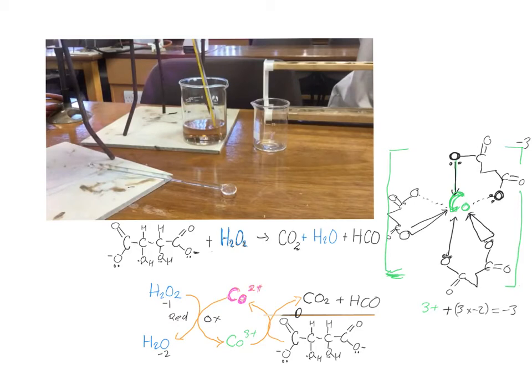And at this point here you can see the pink cobalt being converted into the green oxidized cobalt 3+ ions. You can also clearly see effervescence is happening as carbon dioxide starts to be produced as this species here starts to break down. Notice that the green colour persists for quite a while. So this reaction was carried out at 70 degrees Celsius to overcome the initial activation enthalpy.